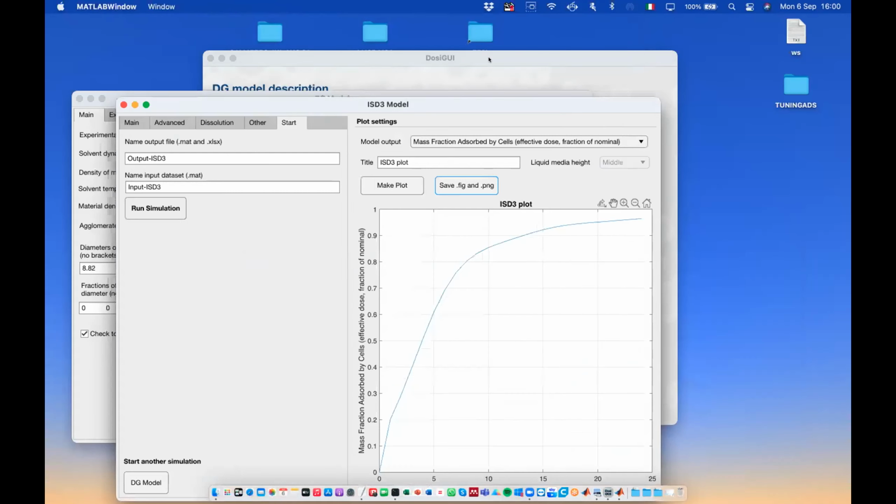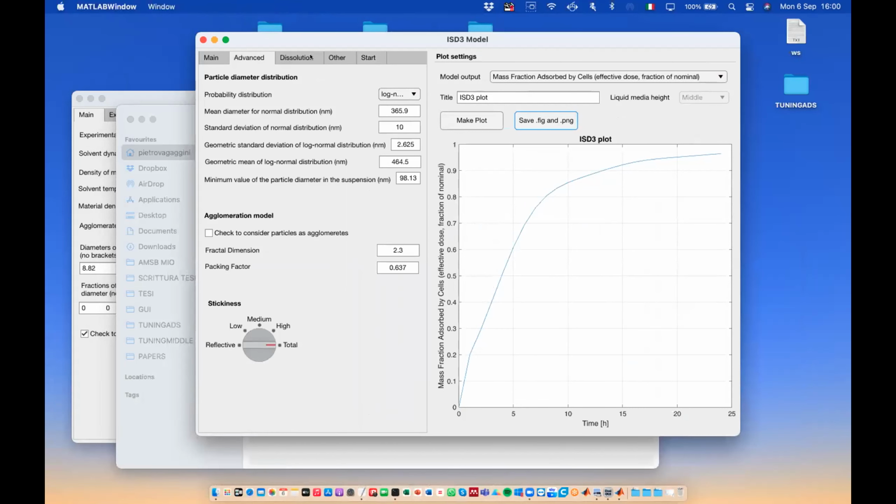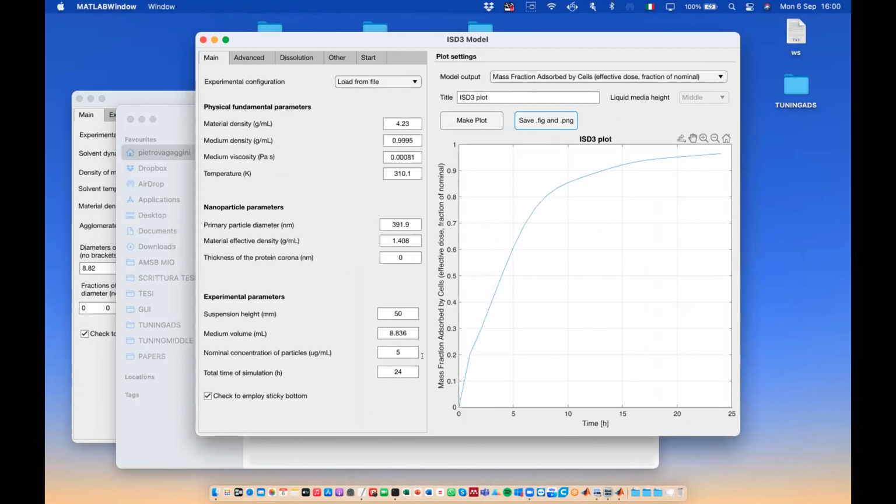This was just an example. Keep in mind that this simulation we made available for download doesn't have the best resolutions, because we wanted to be able to run them without taking so much time from the workshop.